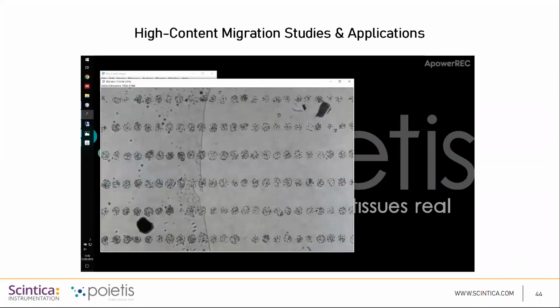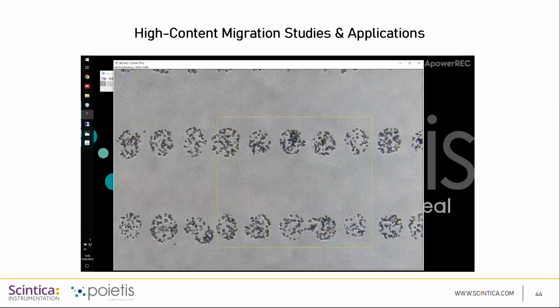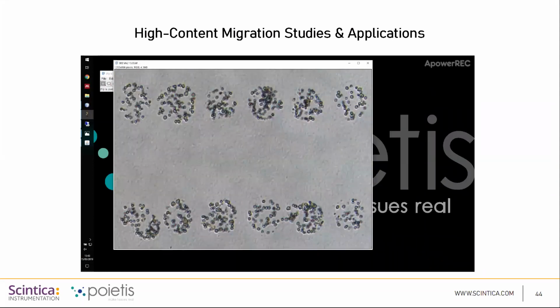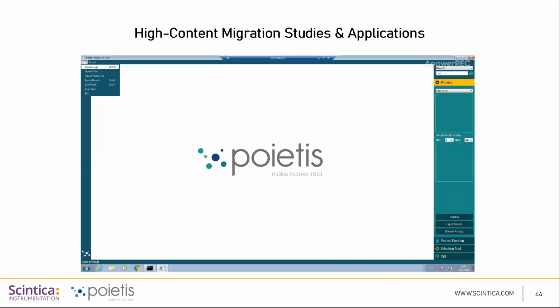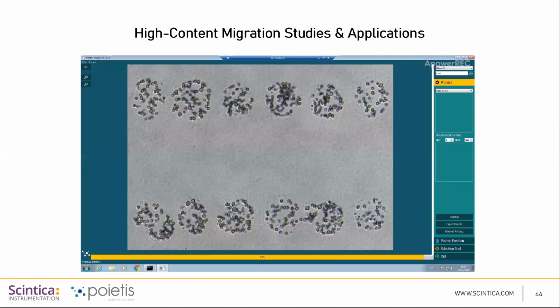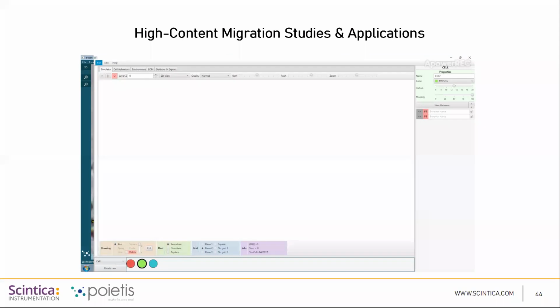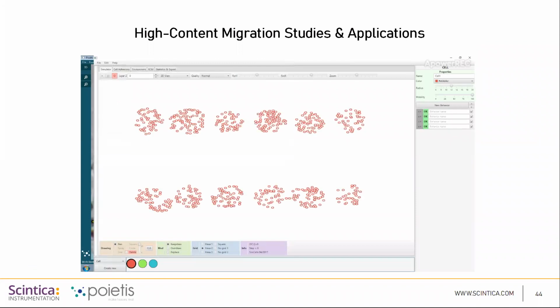His work led to this workflow illustrated in this video. Namely, he used experimental post-printing images taken by the microscope. Here you can see the patterns of fibroblasts printed on collagen. An in-house software allows us to recover the precise position of each cell, what you saw just before, and these positions are transferred to the modeling software Arthur developed.